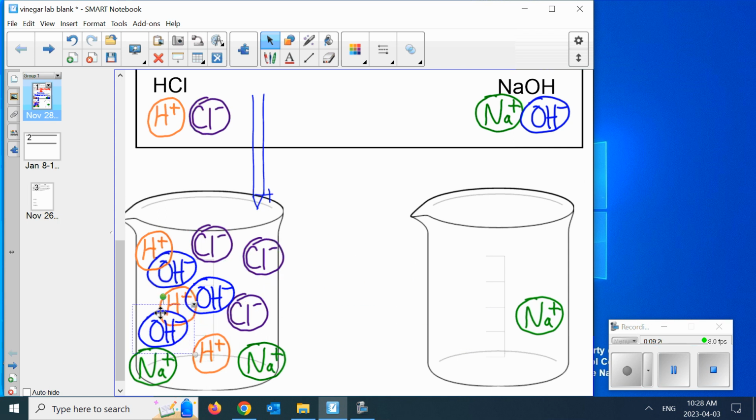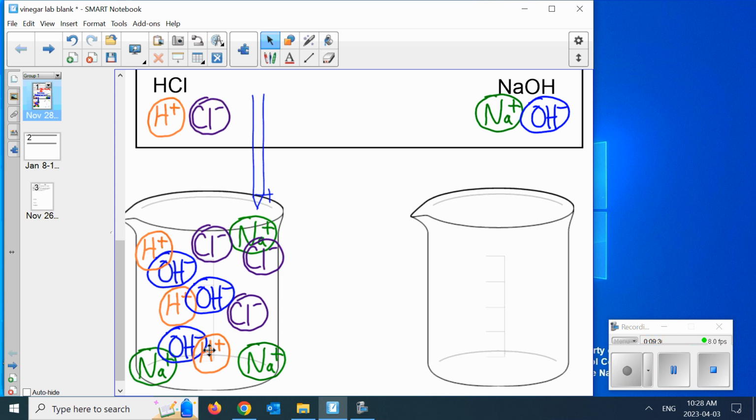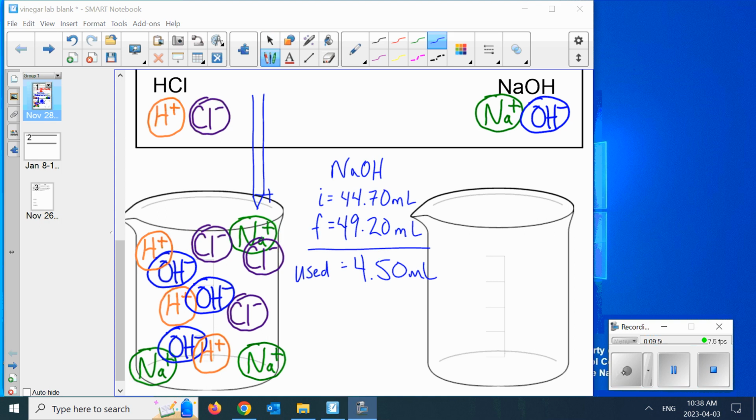Okay, we finally got it. You see that all of the waters are formed here. Right? This would be neutral. This is the idea. You drop, drop, drop until you have all the hydronium ions. I'm not going to show it as H3O+. So I'm just saying the H pluses that make hydronium are attached to hydroxides to make water. It neutralizes. So we're drip dropping. That's what's going on. I will demonstrate. I'll pause the video. So we've kind of demonstrated how the apparatus works.